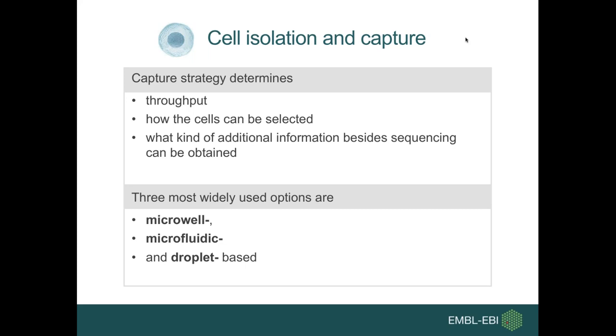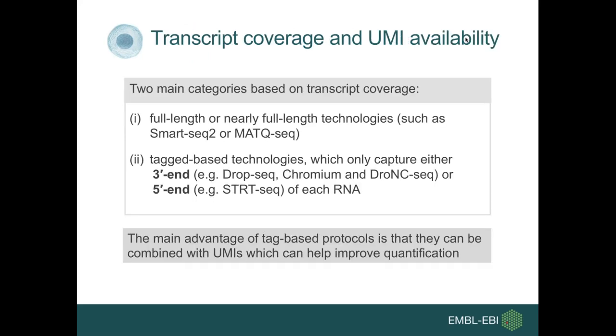So the three most widely used options are microwell-based options, microfluidics, so that would be the Fluidigm C1 chips, and droplet-based methods like 10x Chromium, which I'm going to talk about a bit later as well.